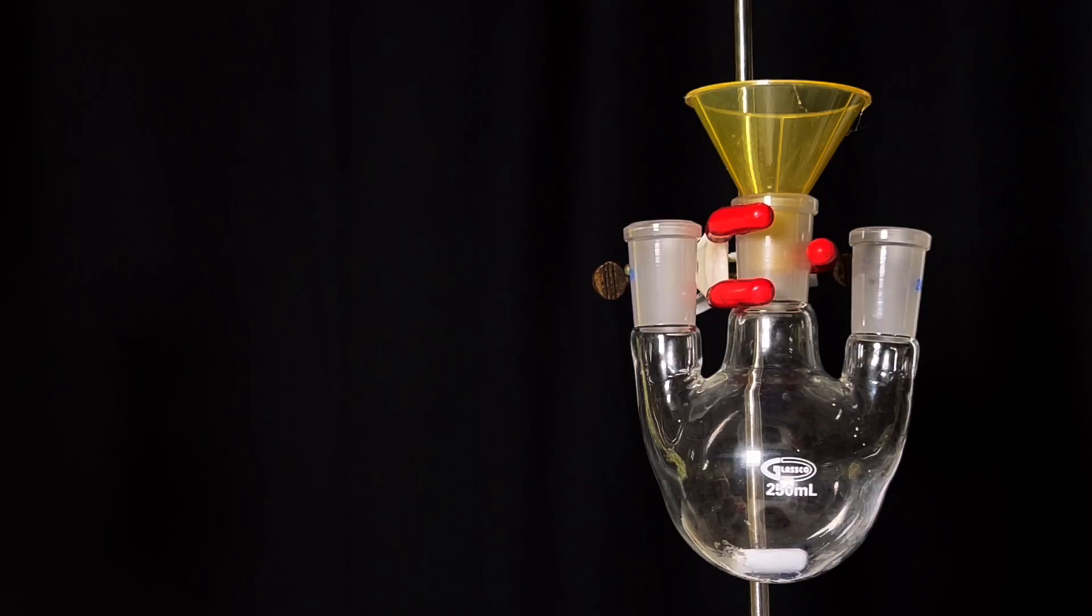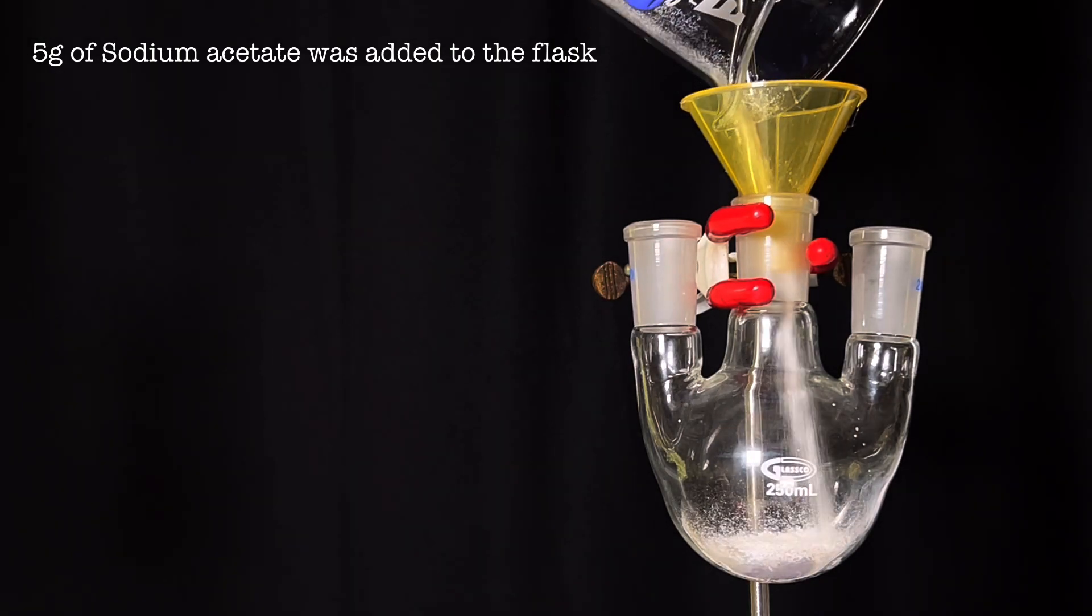Start by fixing a 250 ml three-neck round bottom flask on a stand using a clamp. A magnetic stirring bar was placed inside. A plastic powder funnel was placed on top and 5 g of sodium acetate was added to the flask.